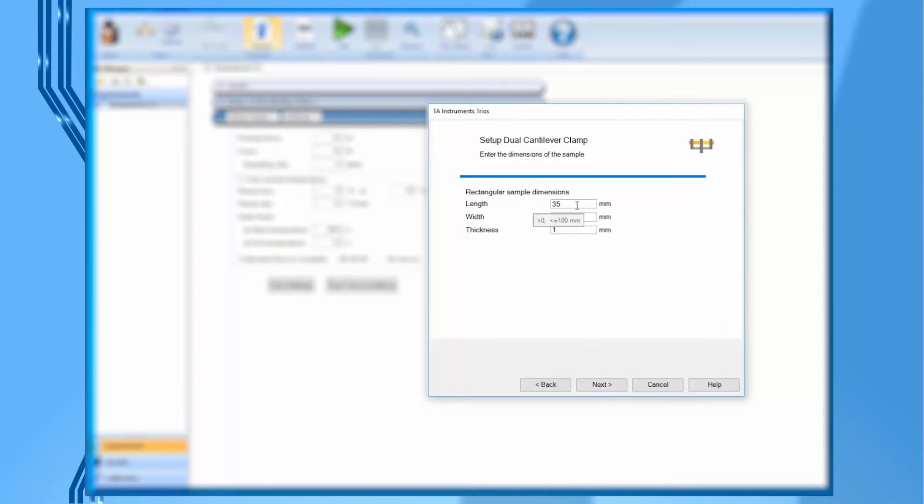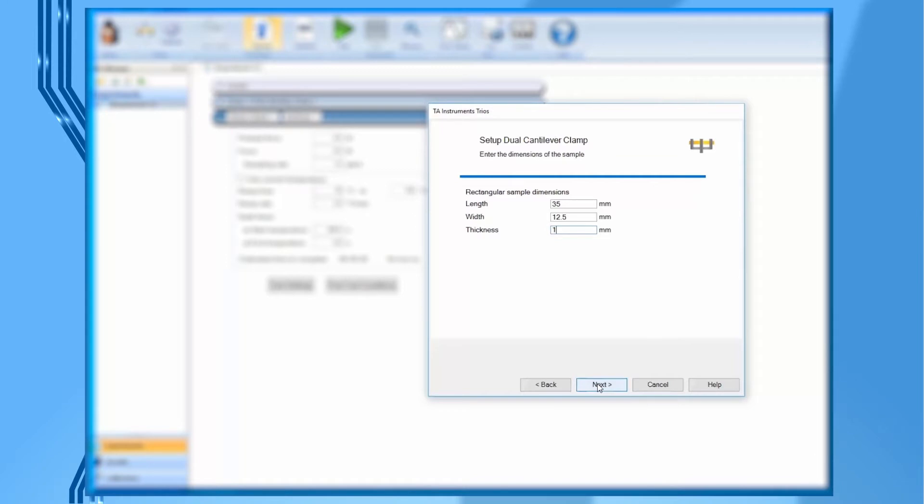In this video, we will use the 35 mm dual cantilever clamp as an example. So under sample dimension, enter 35 mm as the sample length. We can leave the width and thickness as default for now since we'll be measuring and entering those values when we test each individual sample.